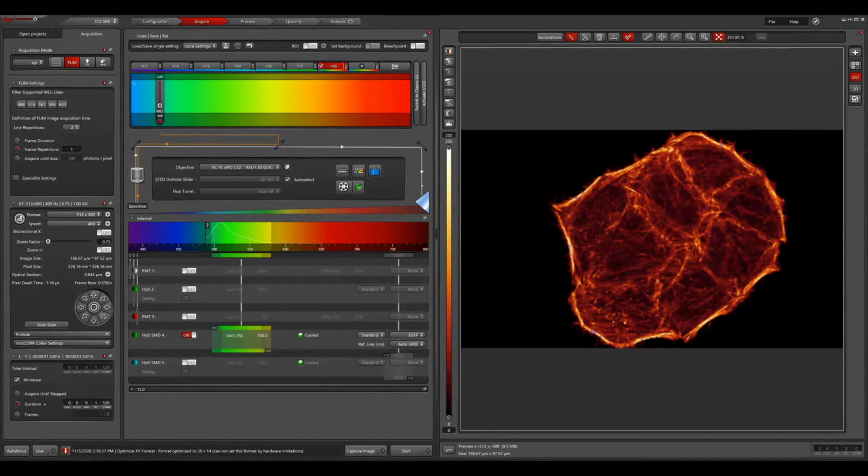Okay, I have switched over to another sample now. These are living HeLa cells that are stably transfected with a nanobody that is binding against GFP actin. GFP in particular has been a very challenging dye with conventional STED methods, simply due to its rather low excitation wavelength, and also due to the fact that you have to use the 592 depletion laser in order to efficiently deplete GFP. If you compare that with the more redshifted depletion laser lines, the 592 puts a comparably high energy load into your cells.